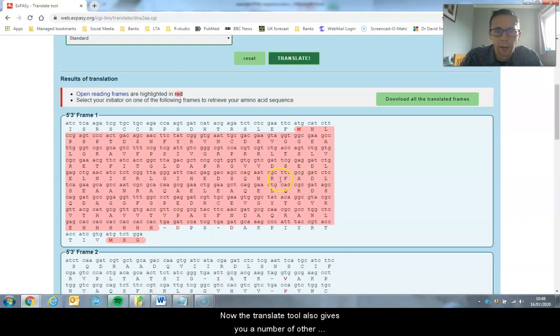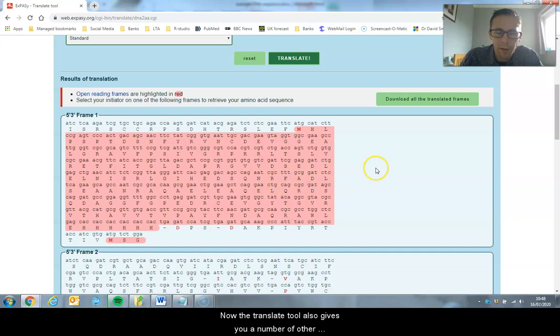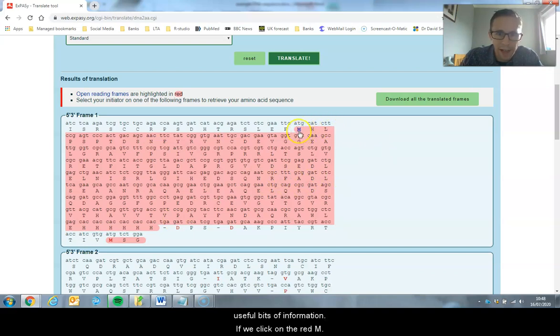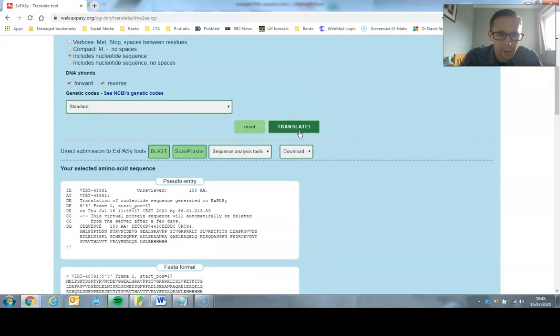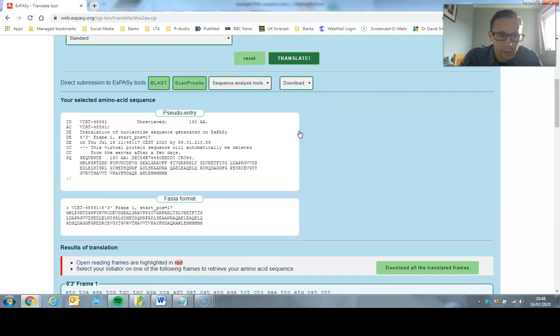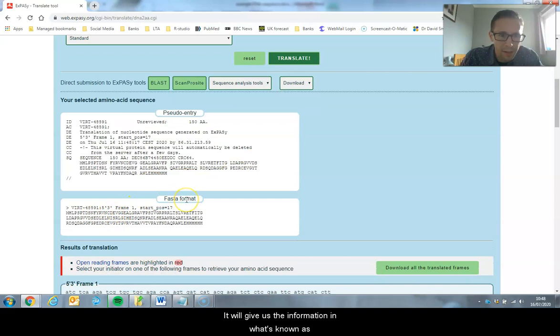Now the Translate tool also gives you a number of other useful bits of information. If we click on the red M, it will give us the information in what's known as FASTA format.